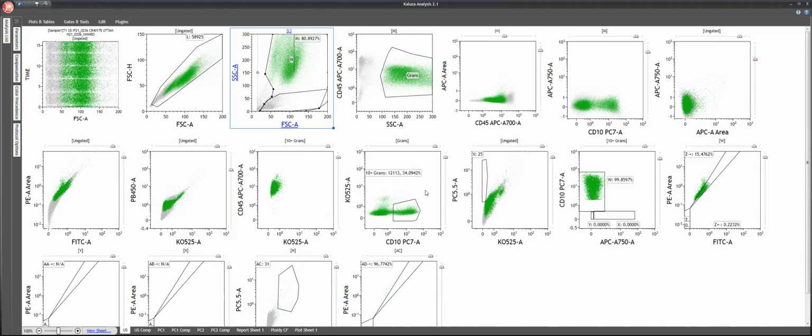More than 60% may indicate hemodilution. In AML MRD, more than 90% is considered hemodilution. So we are also monitoring CD10 positive granulocytes to look at hemodilution. We don't know which cutoff is best, but if we have more than 60%, definitely there is some hemodilution.